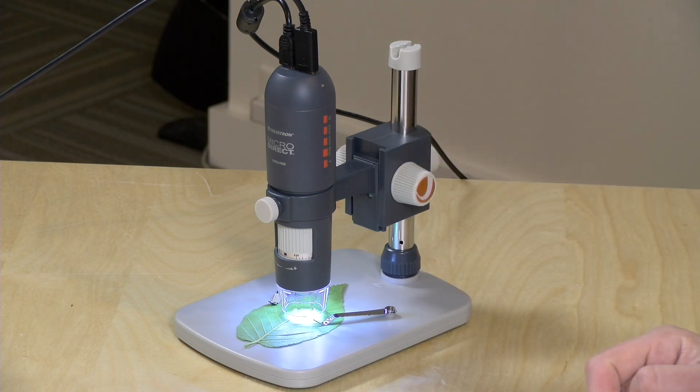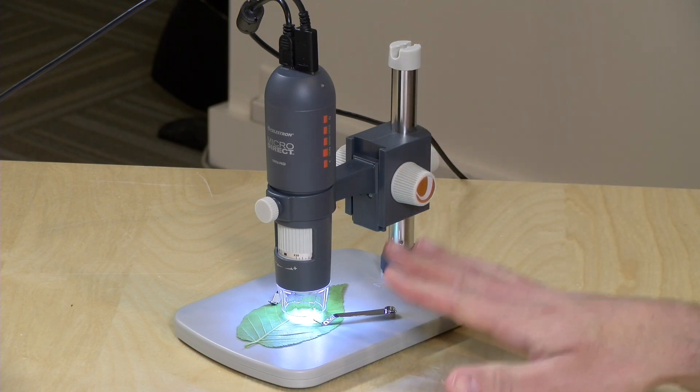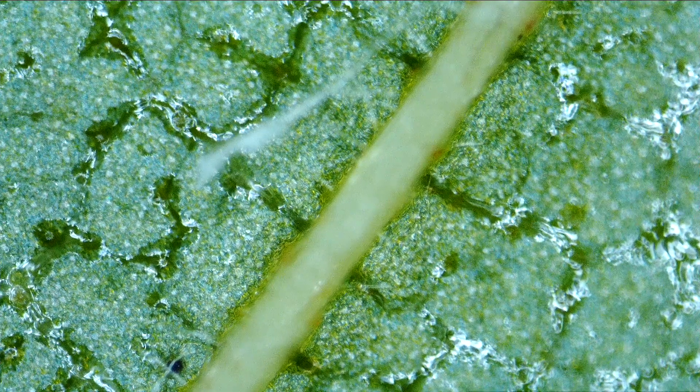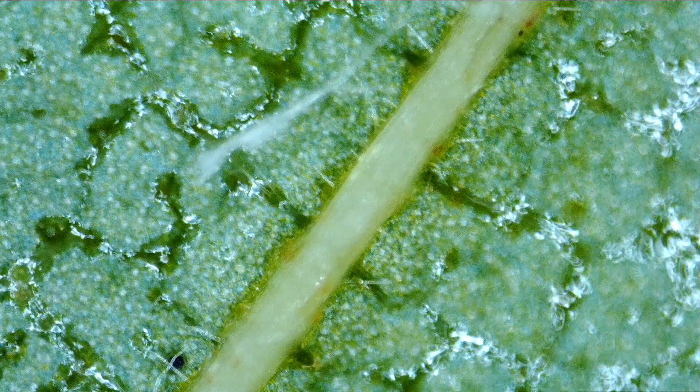This is a 220x magnification microscope. It goes from 10x to 220 and you can see we've got a leaf in there right now, and this is what that leaf looks like at its maximum magnification.